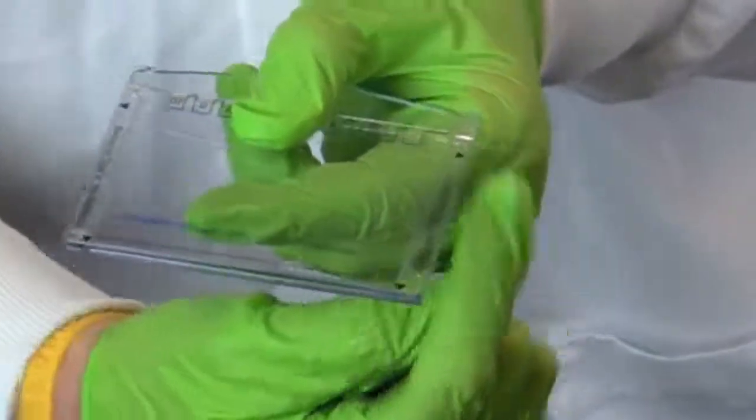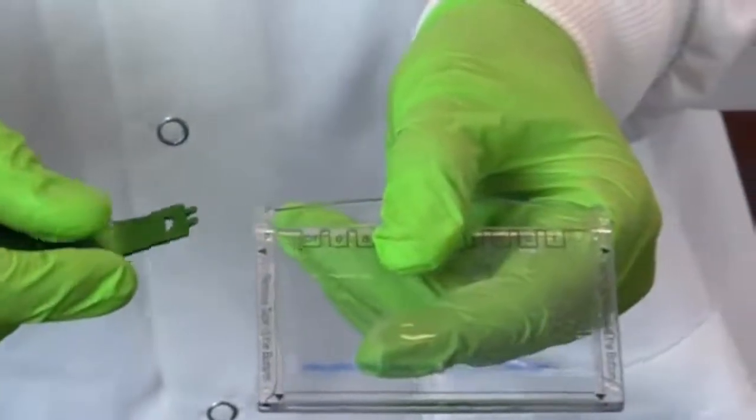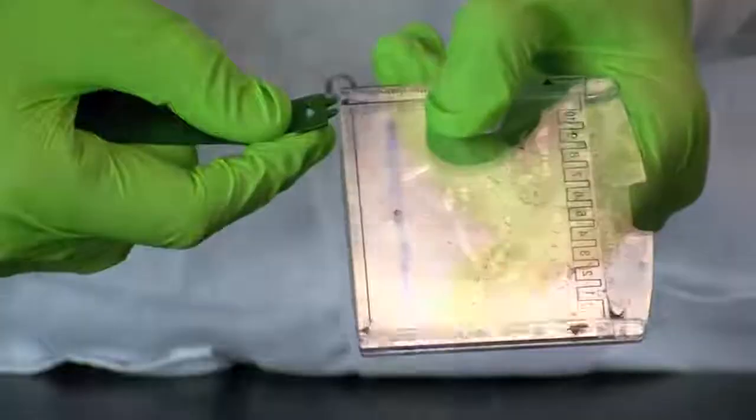Next, remove the gel from the gel cassette using the opening key. Line up the arrows on the opening lever with the four arrows on the cassette to open the cassette.